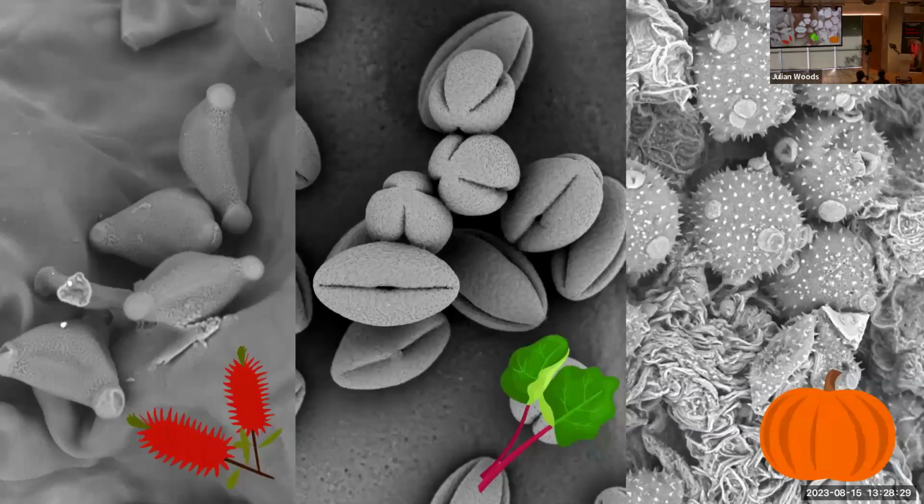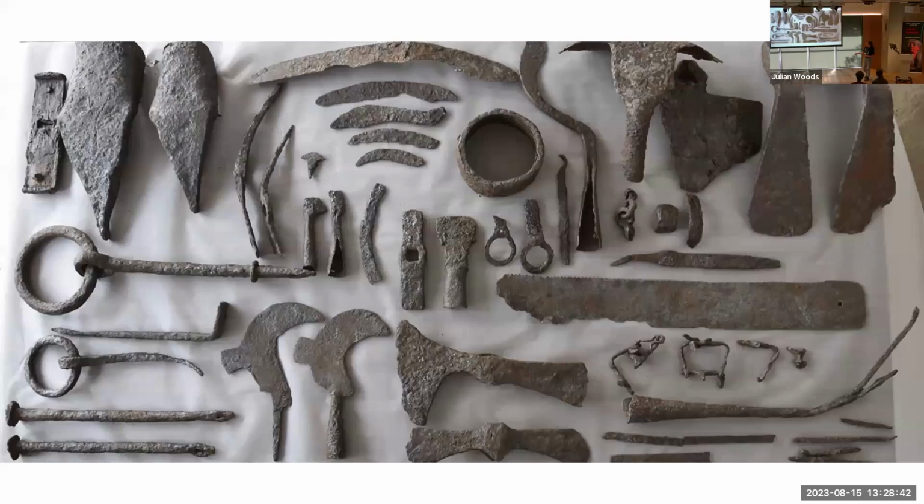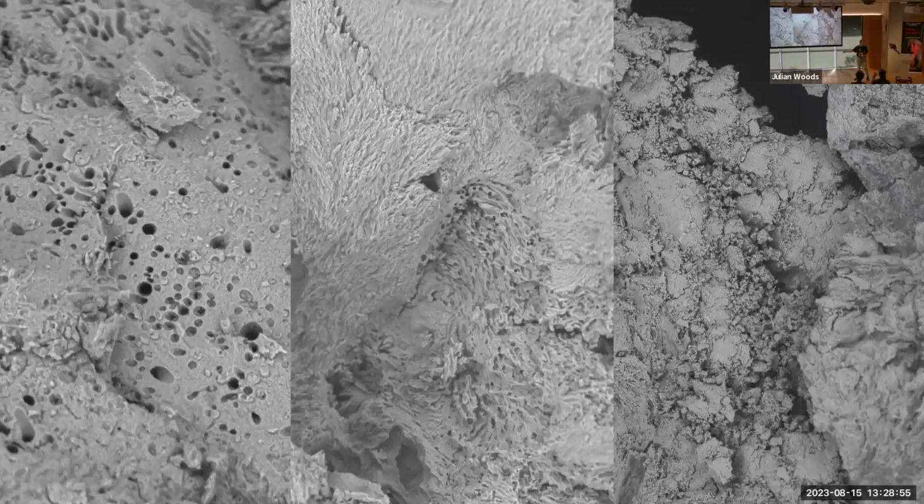All right, so hopefully through that interview process, you've now come to appreciate how different pollen structures look and how different they look at the scale our electron microscopes can get to. Now, from this, we can look at our tools and look for these traces of pollen, and then, like I've mentioned before, trace it back to their uses. Not only can we just look at pollen surfaces, but we can look at the surfaces themselves.